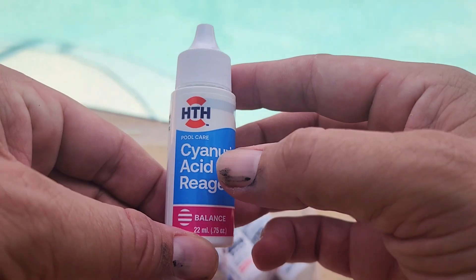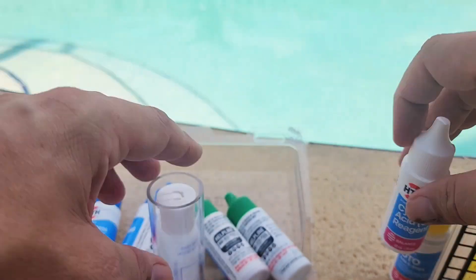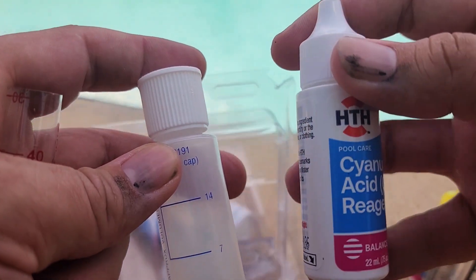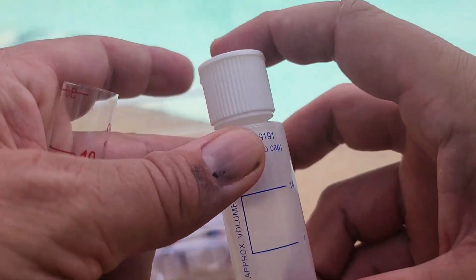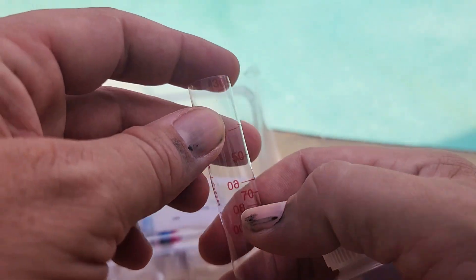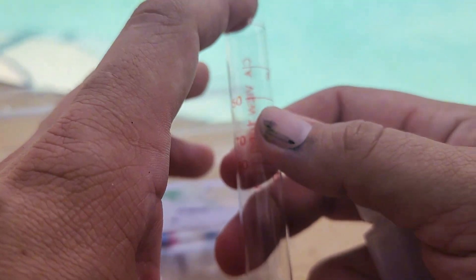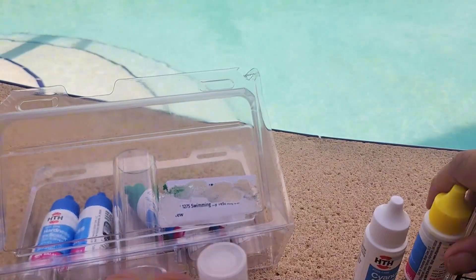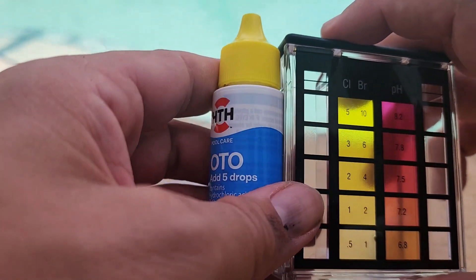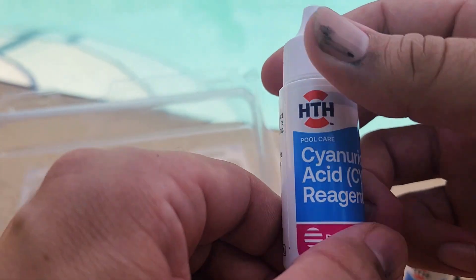You also have a reagent for testing your CYA, which is your stabilizer level — that was something I bought this test kit for. The way it works is you fill to the 7 mark with pool water, then use the reagent to fill to the 14 mark, mix it up, and slowly fill a vial until a black dot disappears. That tells you your CYA level, which is super important because when your stabilizer level gets too high, the chlorine can't work — the stabilizer locks it up. That's why this test kit is important: it lets you get a more complete picture of your pool health.